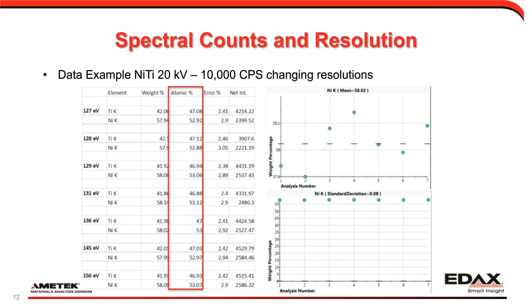So this is the slide that I spoke to, and where we see that as we increase the amp time, speed up the processing, our data stays very stable at around that 53% target value with low standard deviation.